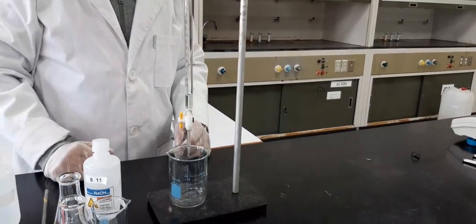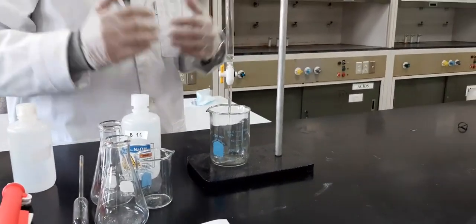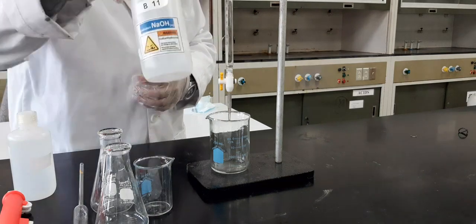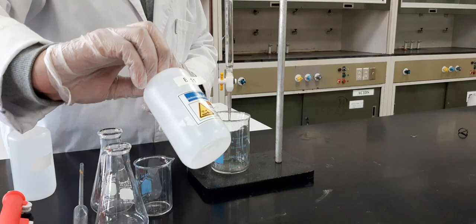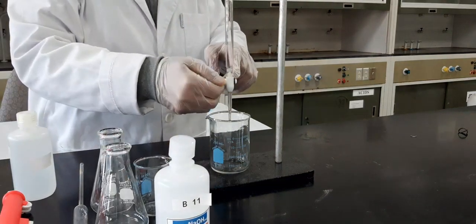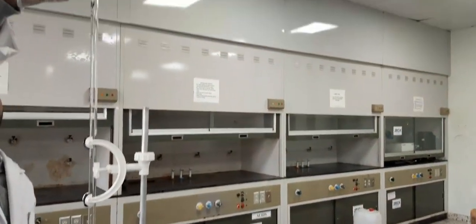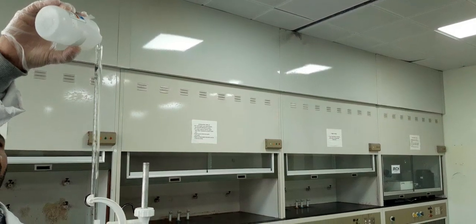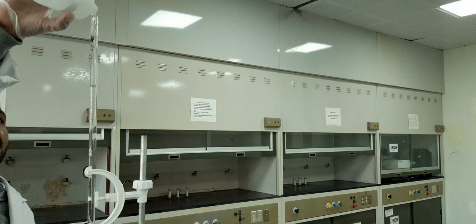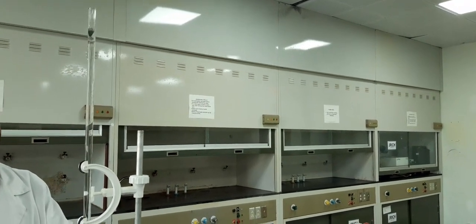Yeah, we washed it. We will wait until it's completely removed, and then we will fill it completely with the same base solution. Now it's completely removed. Now we will fill this burette with the base solution, the same solution we rinsed with, to about 0. This is a 50 ml burette. So now we will bring it down to 0 here.